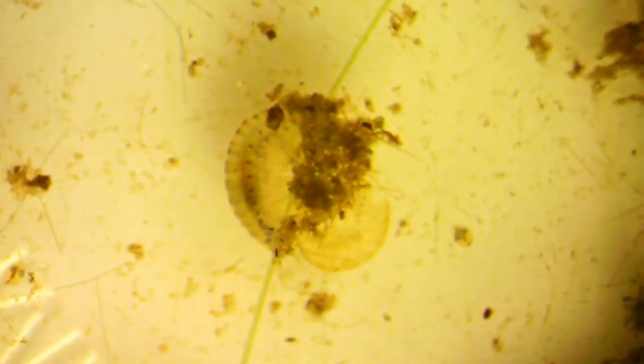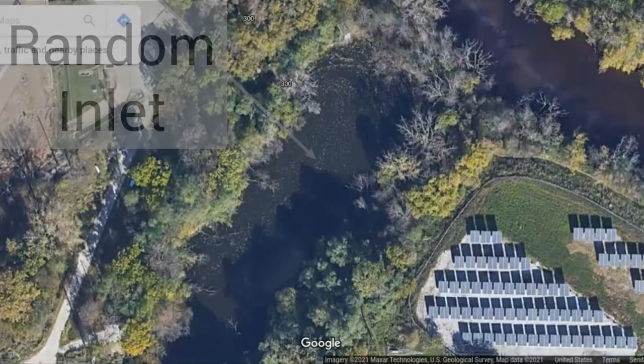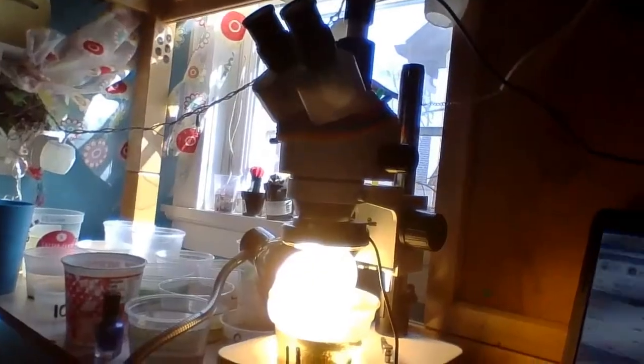That's where this project comes in. This video will explain the massive variety of microorganisms right in our backyard, or in this case, in an inlet just off the Milwaukee River. Using just a microscope and a camera, we can enter the world of microscopy.